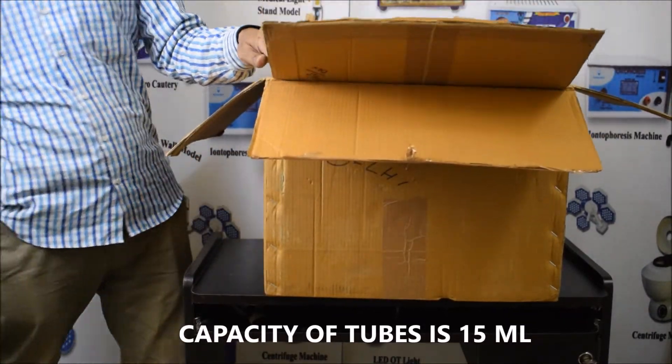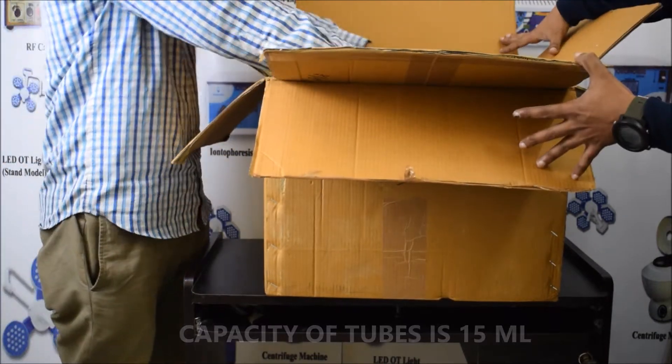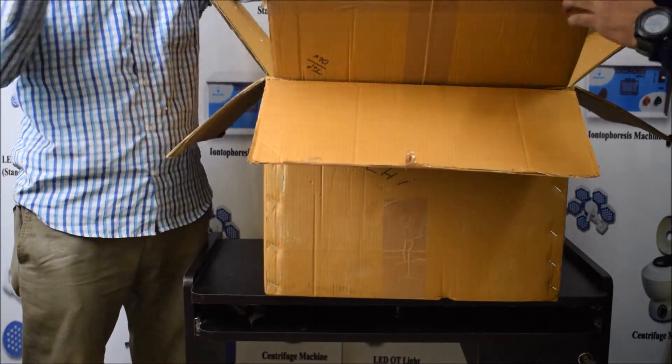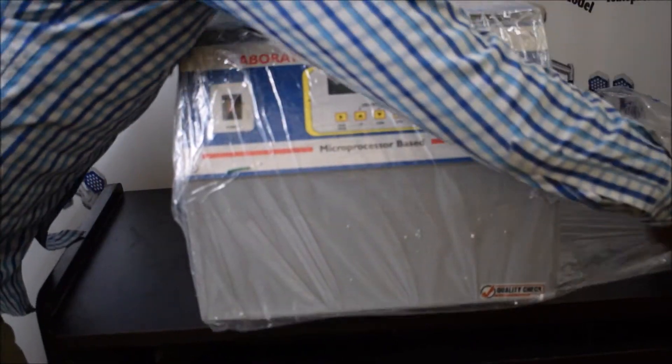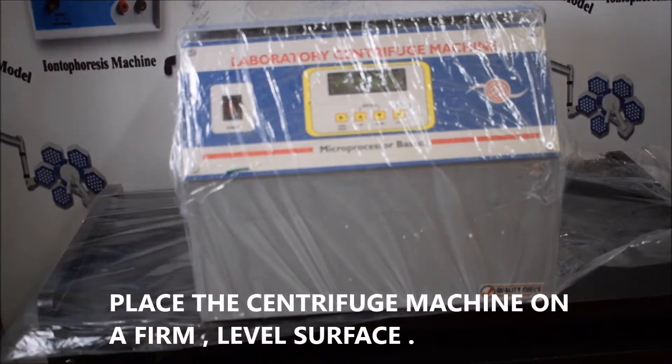This digital centrifuge machine is made up of MS body metal with a voltage of 220 Watt. The RPM of the machine is 4500 to 5000. The approximate weight of the machine is 14.4 kg and the capacity of the machine will be 15 ml tubes and the number of tubes is 8.